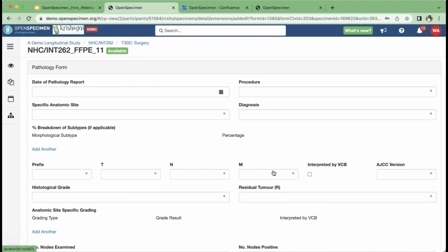So you can add new fields through the user interface easily as an administrator, and you can capture any kind of additional annotations like pathology annotations, clinical annotations, and capture them at either patient level or specimen level. And some of this information, especially the clinical data, if you already have it in other systems like RedCap, Epic, can also be easily pulled over.